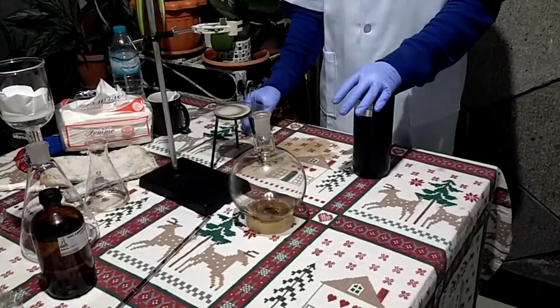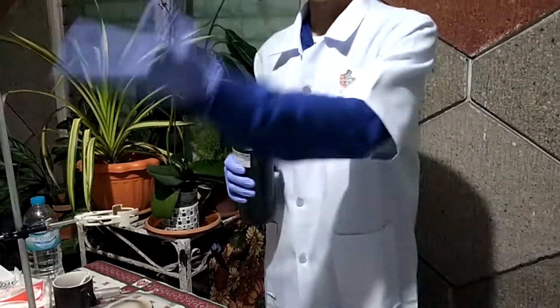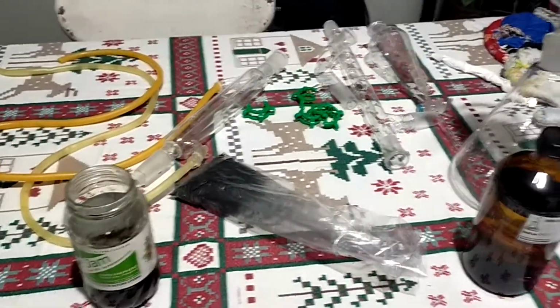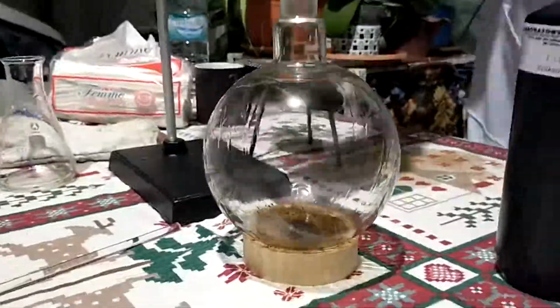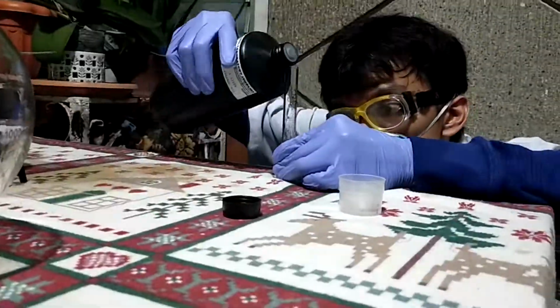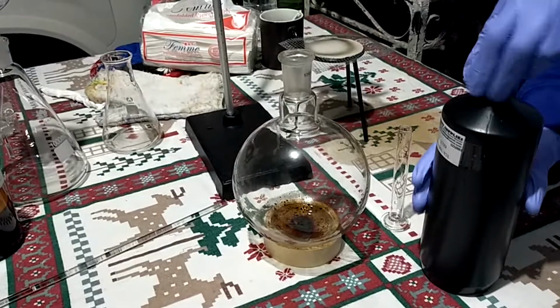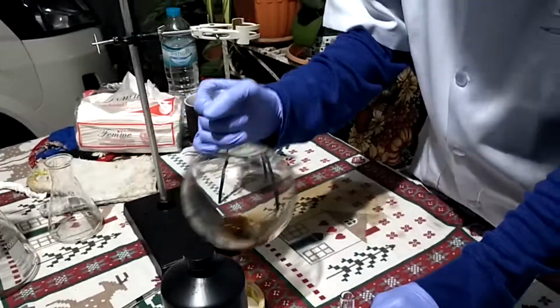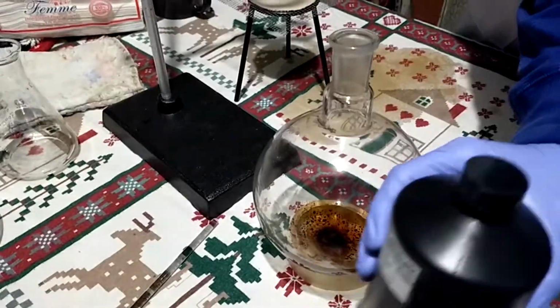form. So, to here, I'm going to add 15 milliliters of ethanol, ethyl alcohol, and then we'll heat it. And then, of course, I'm going to add some solvent until the caffeine is fully dissolved in the ethanol. I do believe this is ethanol. Yes. I'm gonna slosh it a little bit. Maybe I need to add at least 5 more milliliters. I'm gonna make that 20.